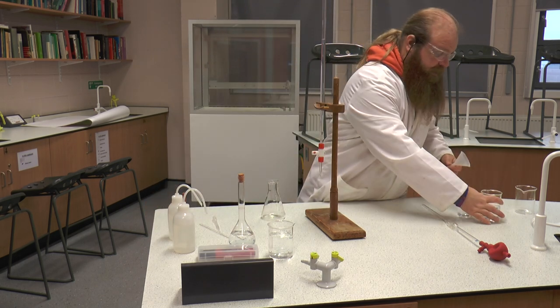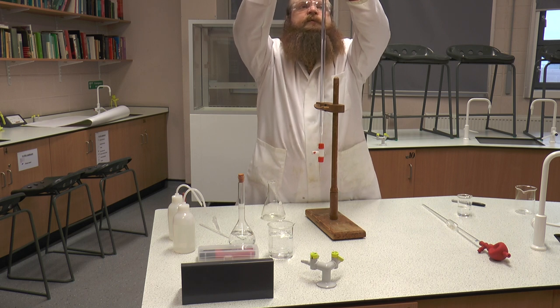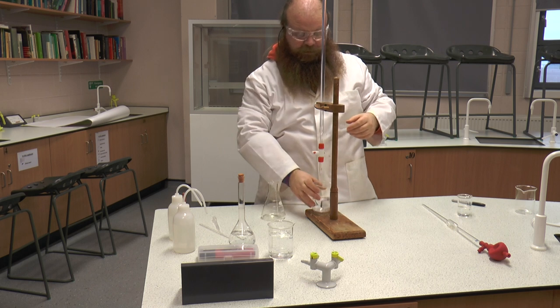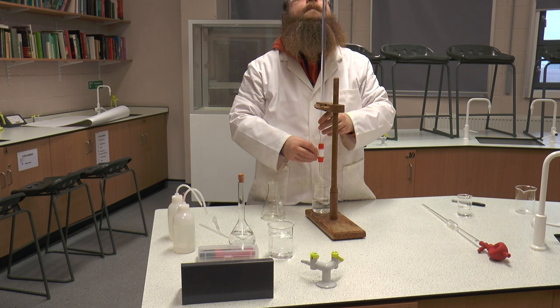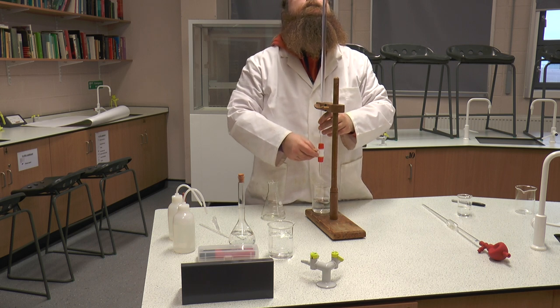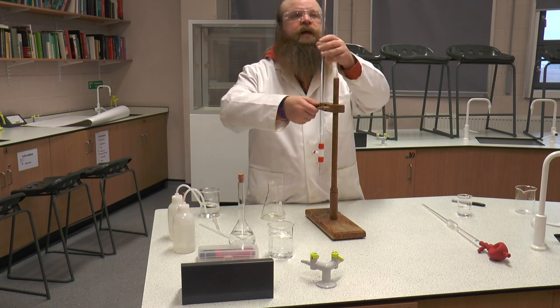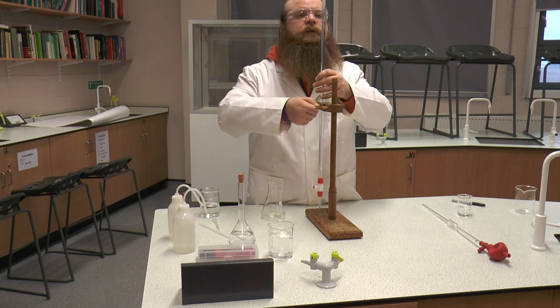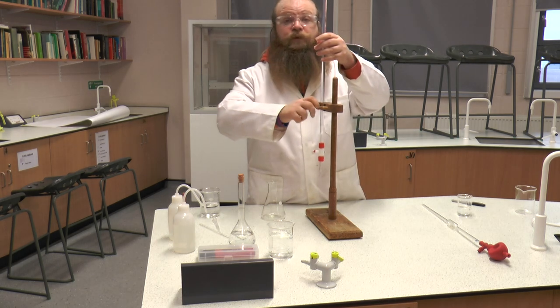We are going to fill up our burette with hydrochloric acid. This time we do not need to get rid of any air bubbles because we have not emptied the burette completely. However, I have gone slightly over zero, so it is going to have to come down a bit. I am going to bring it down so I can see the meniscus, because it is above my eye level, and the meniscus is at 0.1.